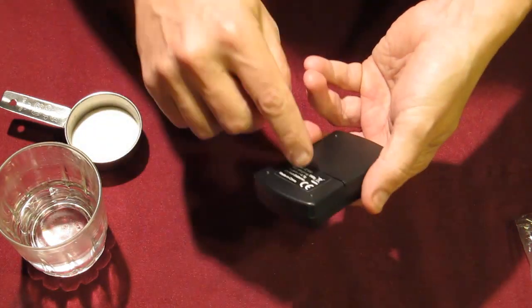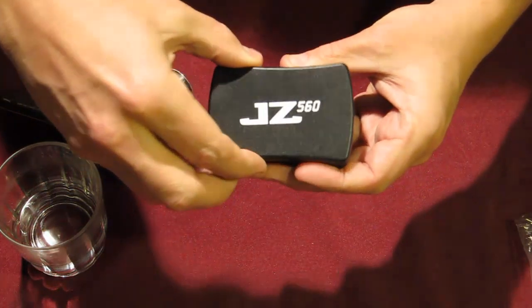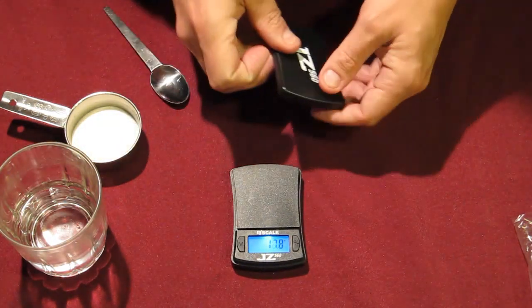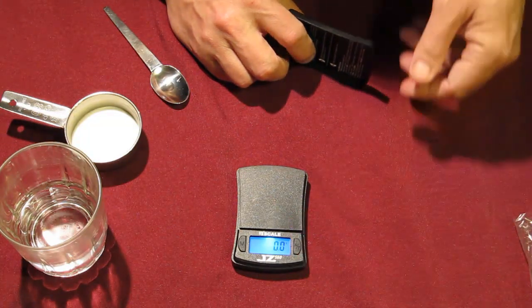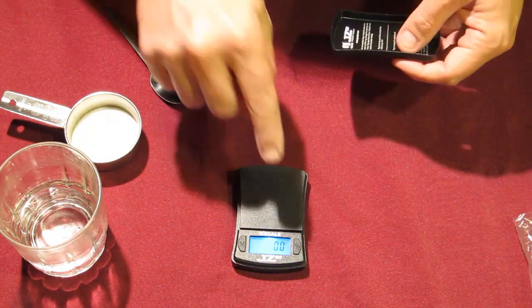Now when I open this up the scale is going to be on because I've just put the battery in. Normally the scale will be off every time you take the front cover off. Set your scale down, press this button once, and that sets the scale to zero.